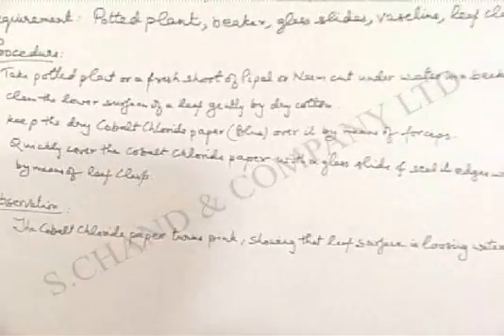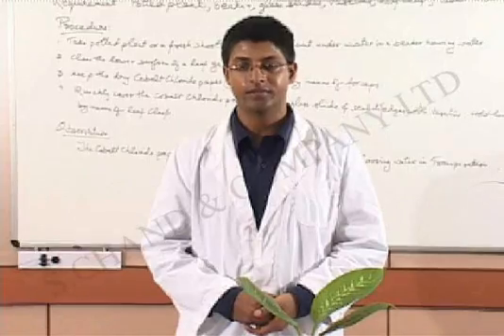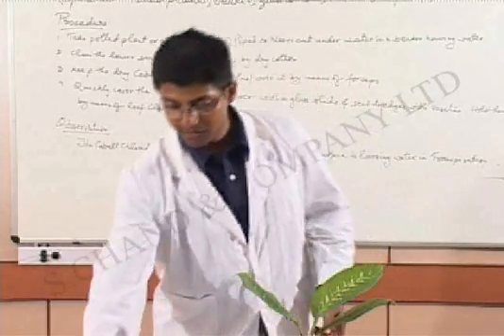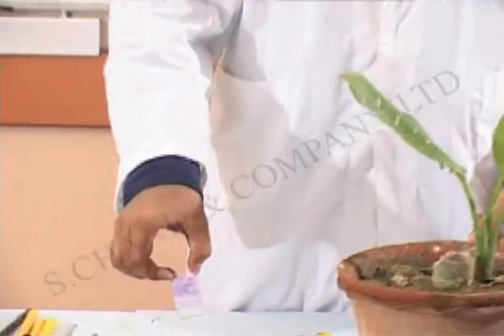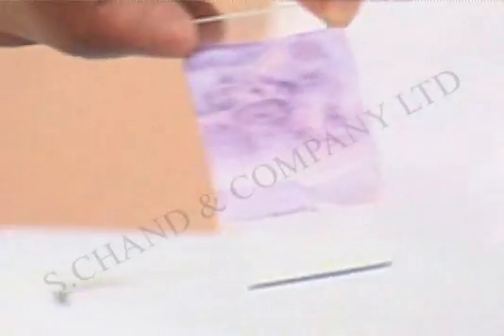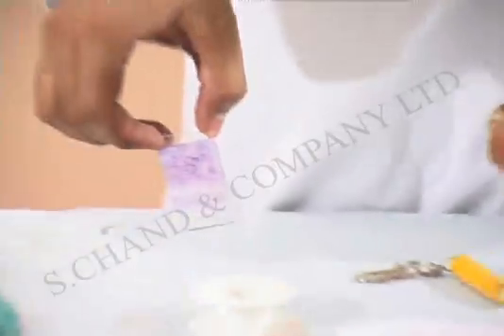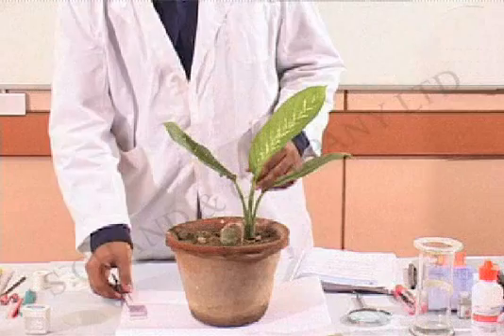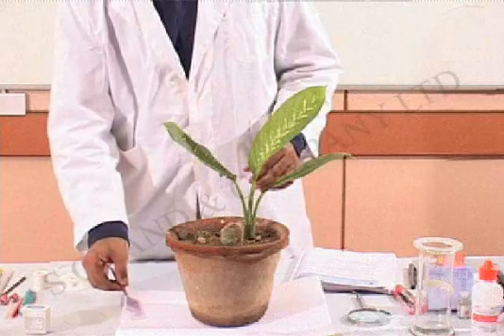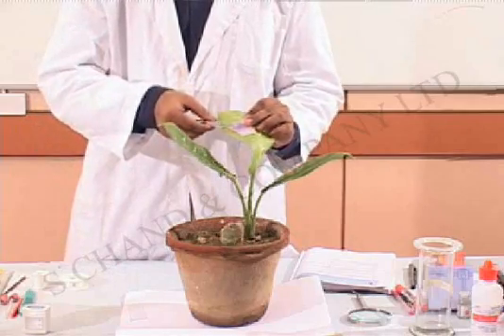To do this experiment, we have everything required for carrying it out. This is our potted plant which we'll be using. We have the cobalt chloride paper and a slide. We have already wiped the underside of the leaf. This is the cobalt chloride paper which I placed on the underside of the leaf, right there.